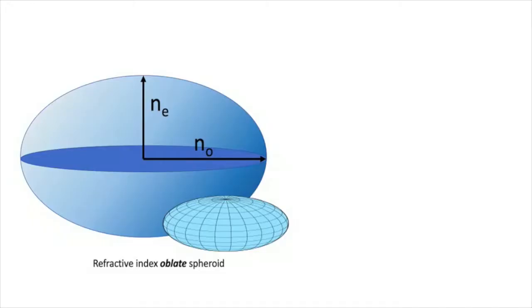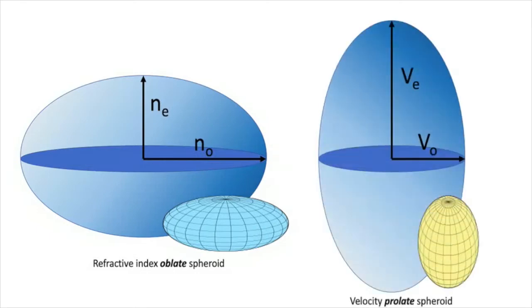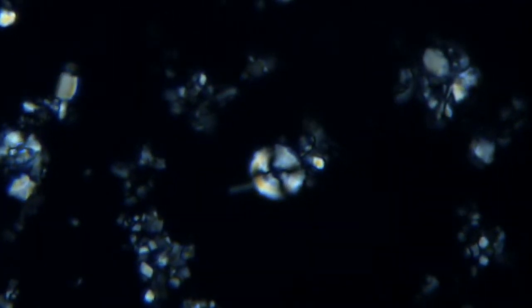We mentioned several times that calcite is a uniaxial negative mineral. We said why, but we haven't demonstrated it. We'll explain now how that can be done. Note that the following procedures are not used or necessary on calcareous nanofossil observations.